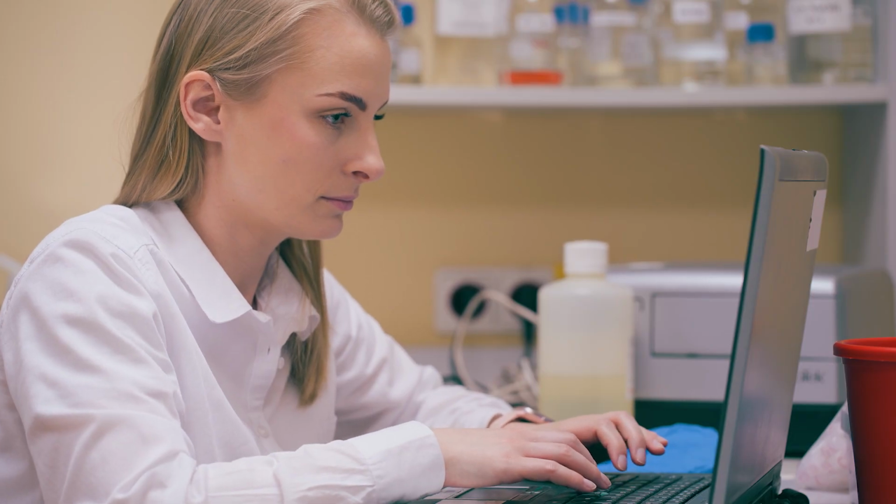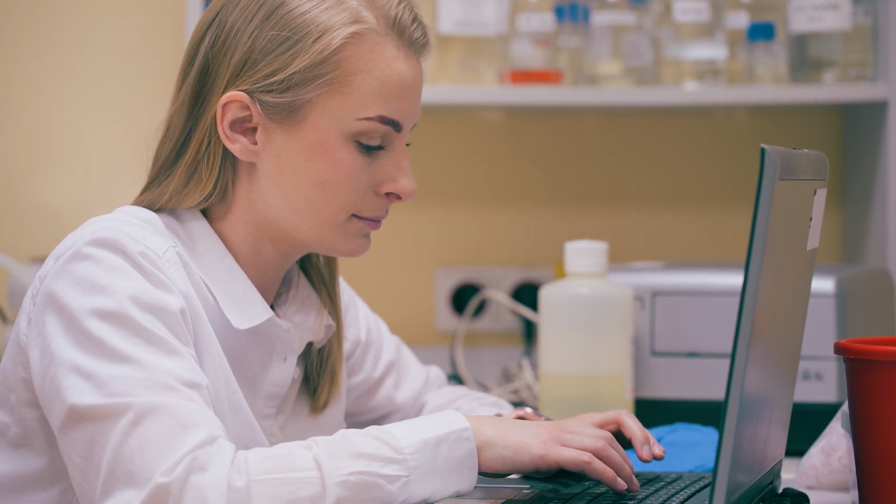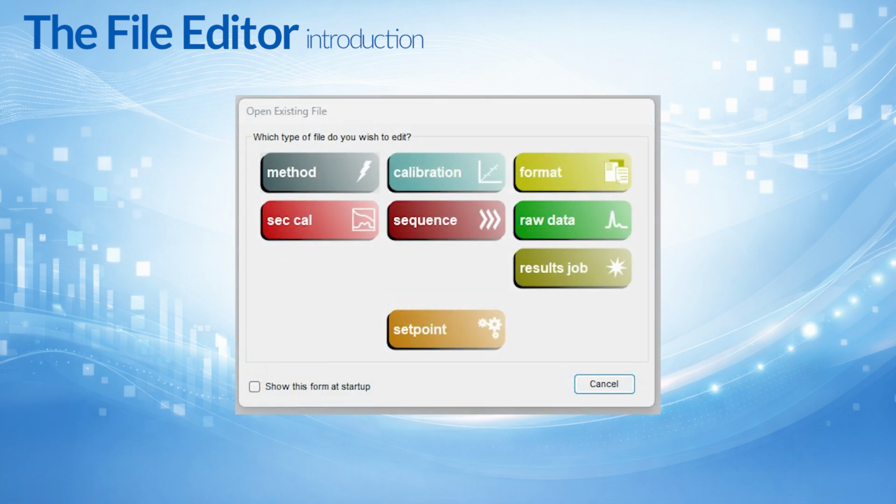It is designed to go through a quick overview of the file editor and focuses on the basic functions and layout of the program. The file editor allows users to create, edit, and print Chromperfect files. It is a central utility used throughout the system and supports a wide range of file types.